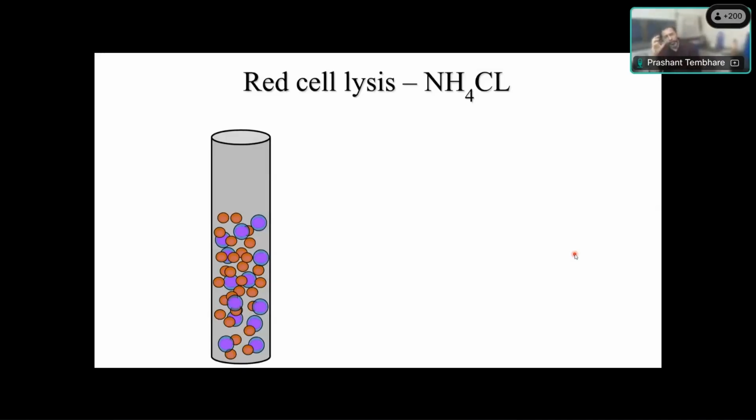So we have to make a single cell suspension, usually in bone marrow or peripheral blood. In fact, in FNA from the tissue, you can take tissue and cut the tissue and make a single cell suspension. Body fluids like CSF, pleural effusion, ascitic fluids, any cells which can be analyzed in single cell suspension can be used for flow cytometric analysis. Now, how do we process?